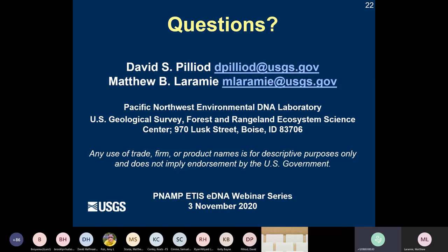So I understand the frustration there that there are so many methods out there. And I think some standardization, even just for a few protocols that can be used, is really useful. And David showed a few on the field side of things, a few protocols that are widely used. They might not be optimized for every habitat or every organism, but most of these tend to work really pretty well and can be adopted to different habitats with just some simple modifications.